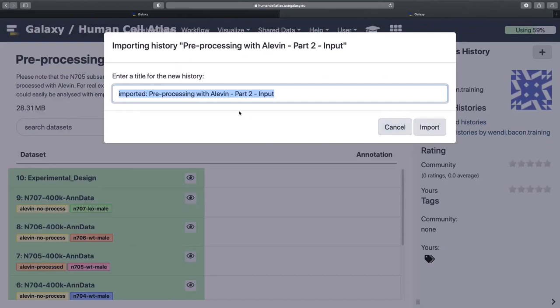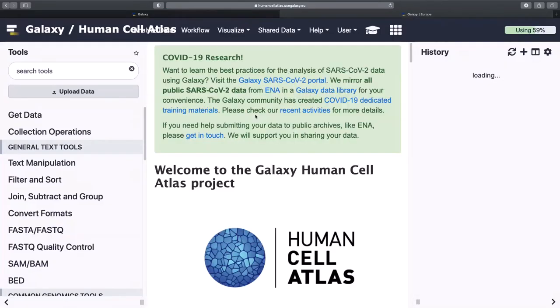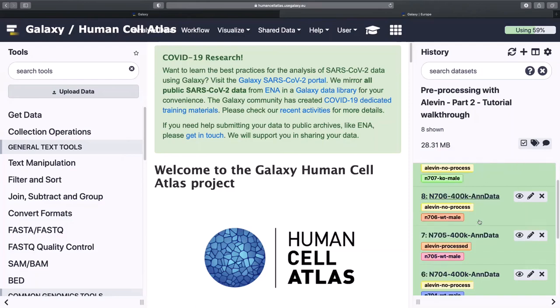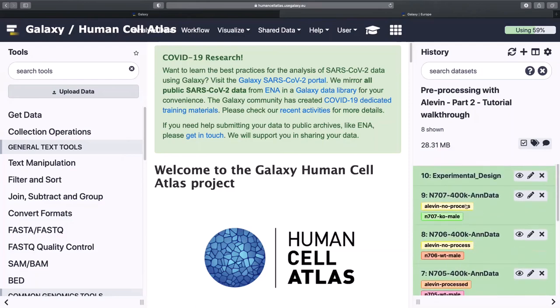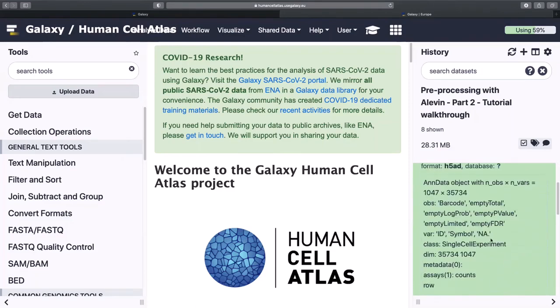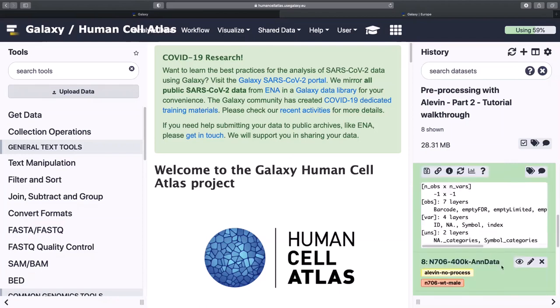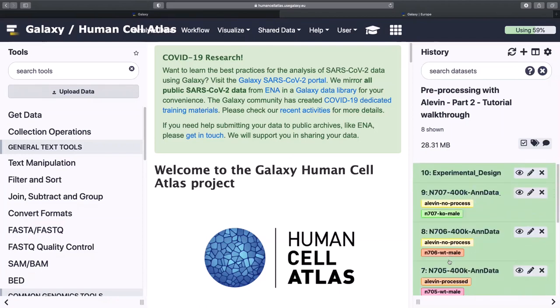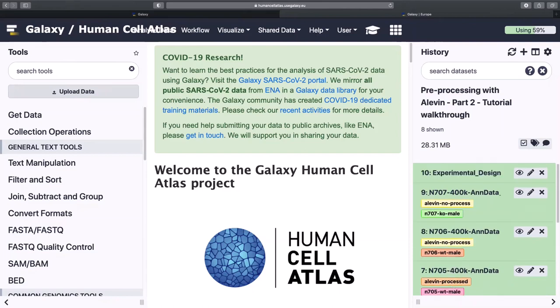All right, and here we are. I went through and added little labels, which you can do by clicking on any dataset and adding a little tag, just so that I would know which one was male, wild type, et cetera, all the metadata, which is quite important.